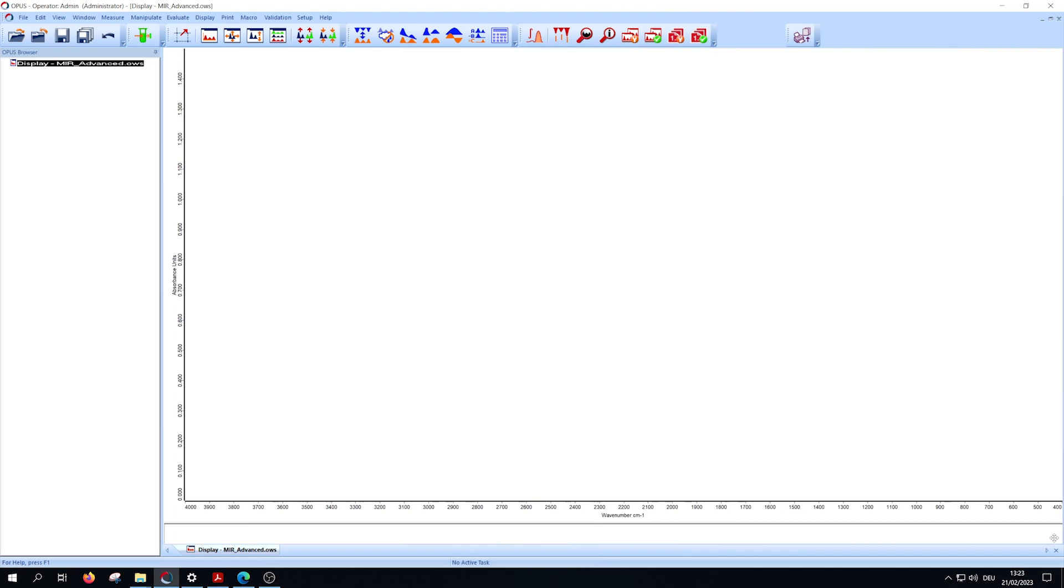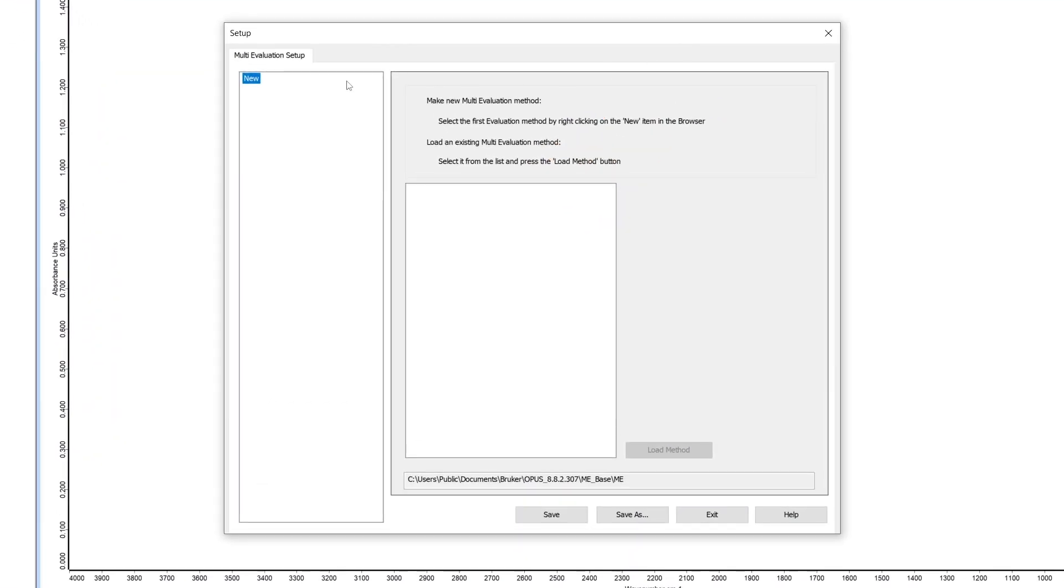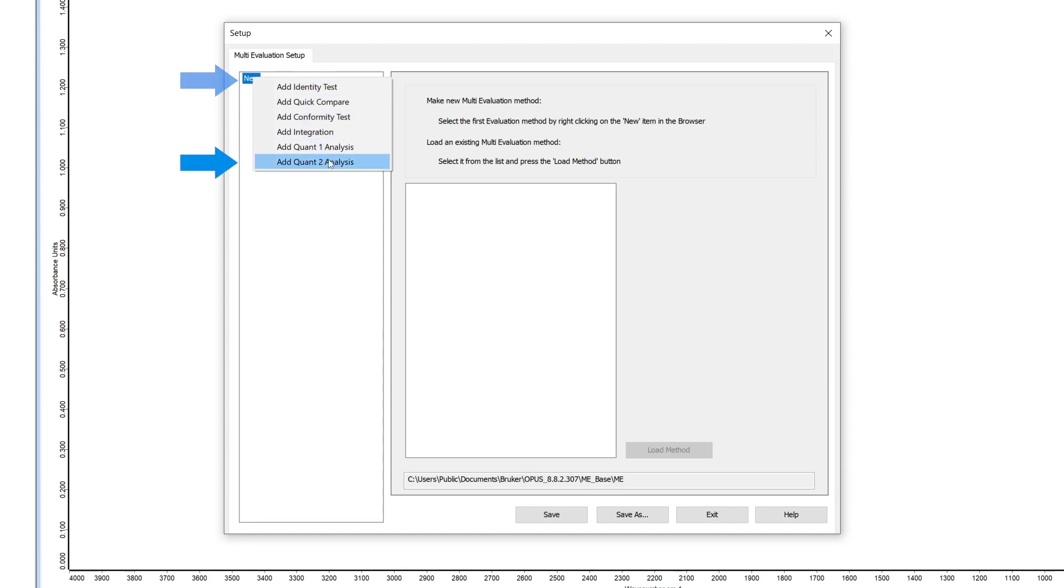To start, open the MEV setup, add your QUANT2 methods for the large concentration range.